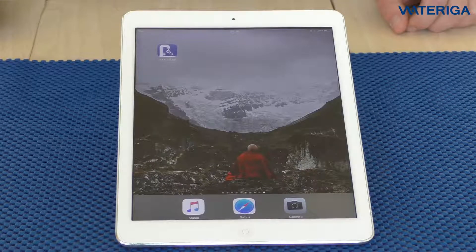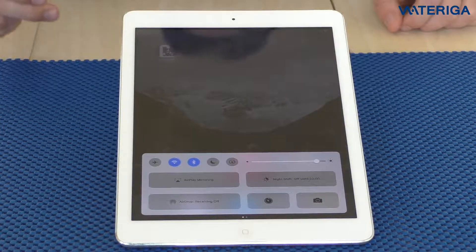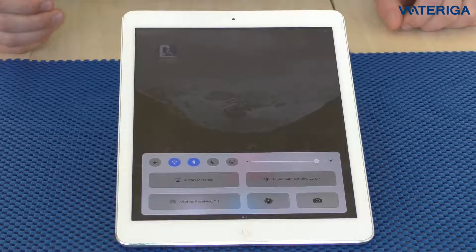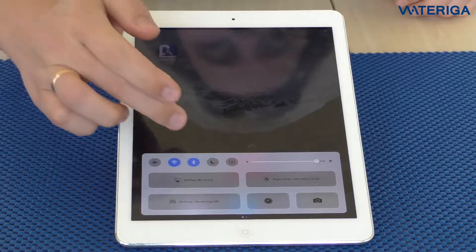Before we start the app, let's make sure the Bluetooth is switched on on the smart device. We need Bluetooth in order to connect the app with the photometer. Bluetooth is on, so we're good to go.